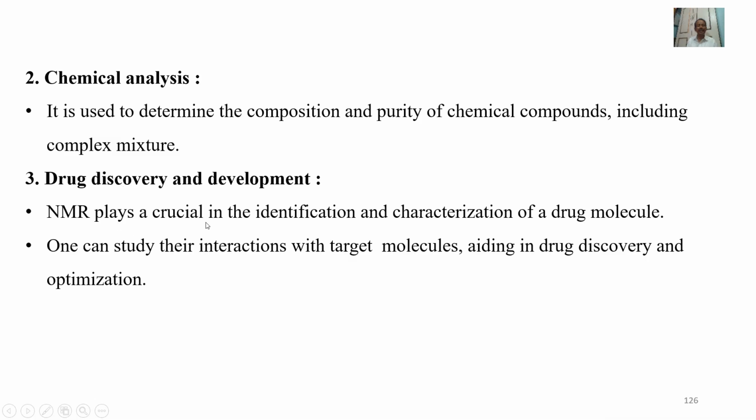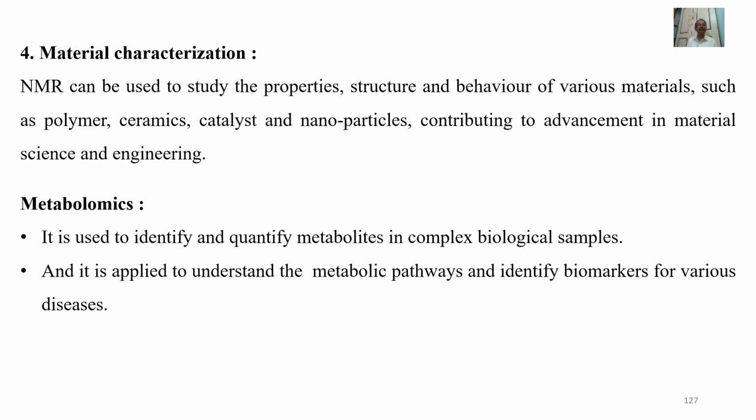NMR plays a crucial role in the identification and characterization of a drug molecule. One can study their interactions with the target molecules, aiding in drug discovery and optimization. Material characterization. NMR can be used to study properties, structure, and behavior of various materials such as polymers, ceramics, catalysts, and nanoparticles, contributing to advancement in material science and engineering.